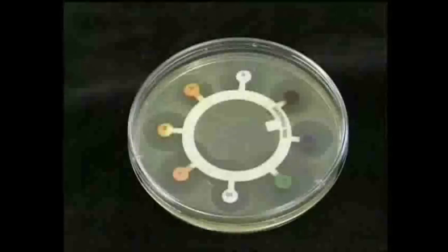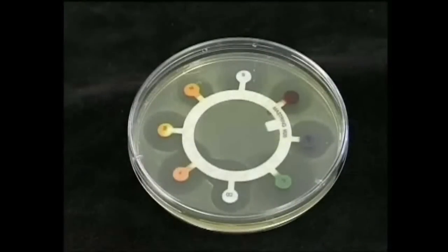Such plates can be used to assess the sensitivity of microorganisms to various reagents which claim to be antibacterial, for example, antibiotics, toothpaste, mouthwash, and essential oils. Plates used for antibiotic sensitivity tests should be sealed and not reopened. There must be no subculturing from these plates.